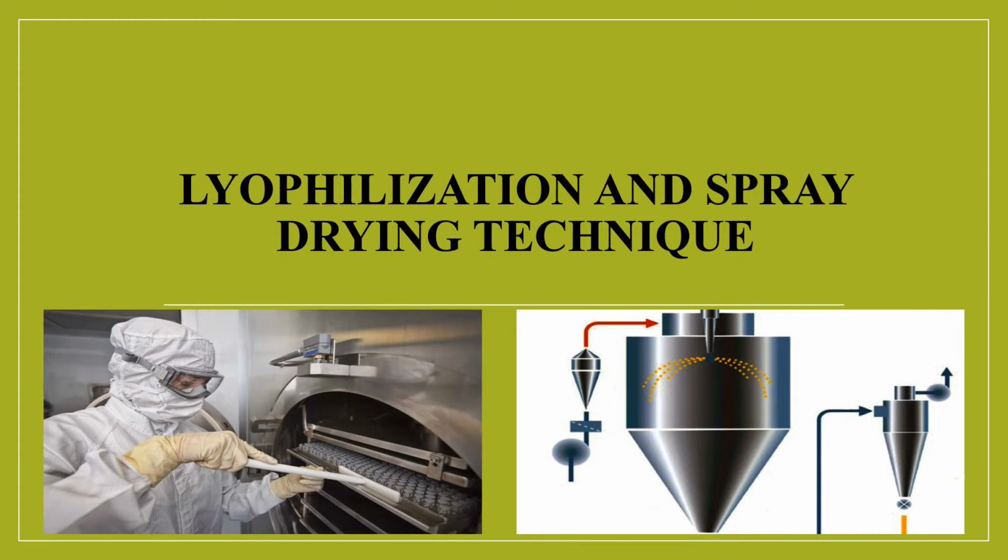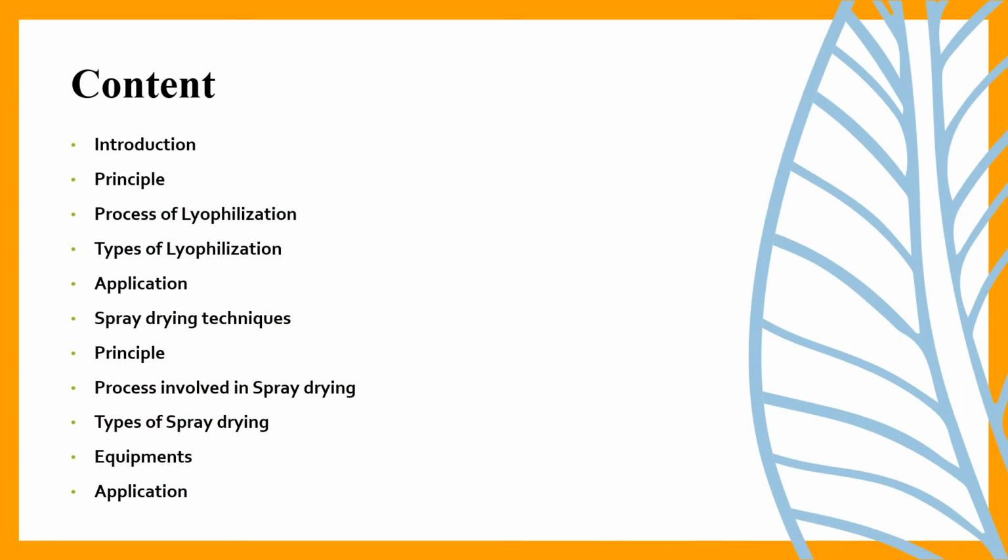Today I am discussing the topic of lyophilization and spray drying technique. These are the contents which I will be discussing: the principles, process, types and application of lyophilization. Then spray drying techniques, its principle, process, types, equipments and application of spray drying.